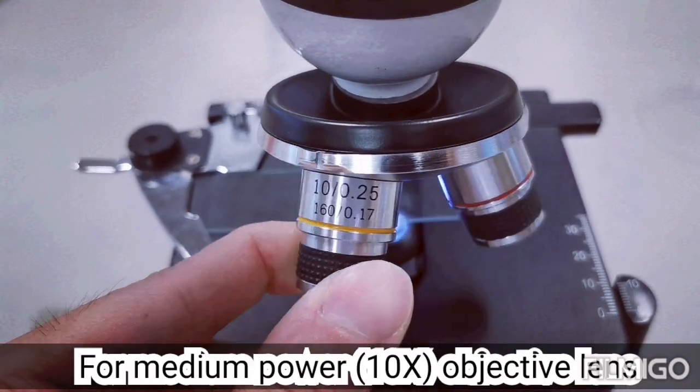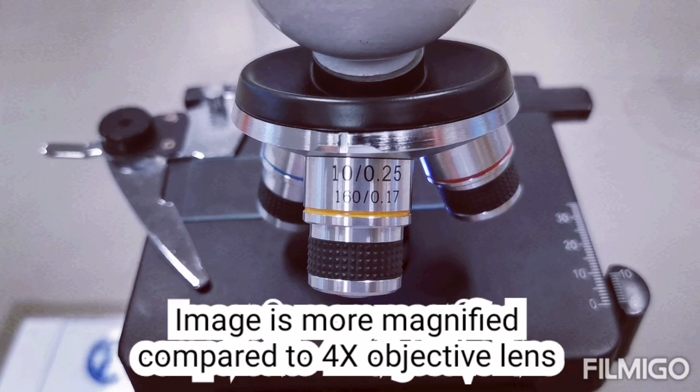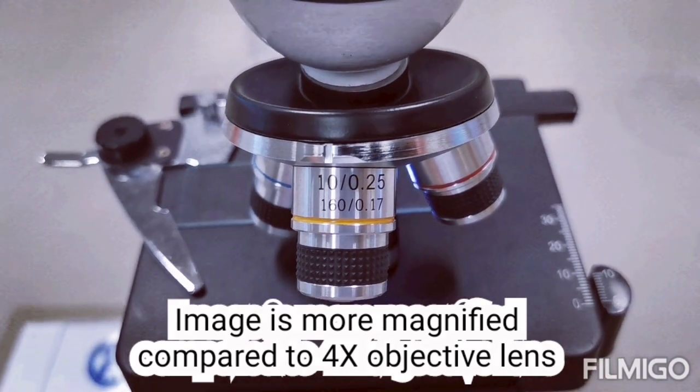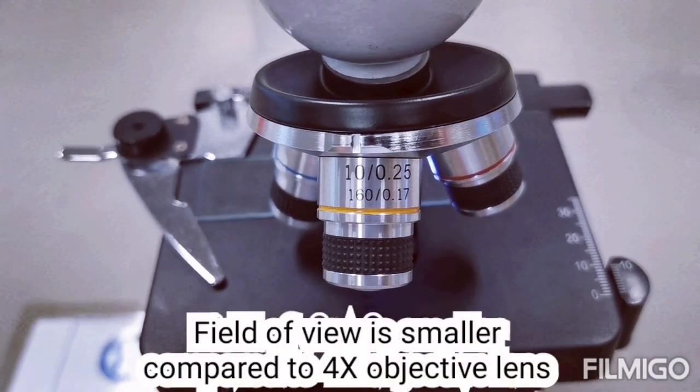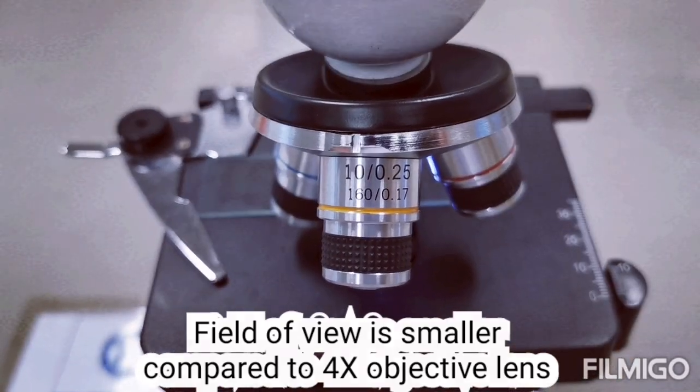For the medium power objective lens, or the 10 times objective lens, the image is more magnified now and larger, however the field of view is smaller or more zoomed in compared to the 4 times objective lens.